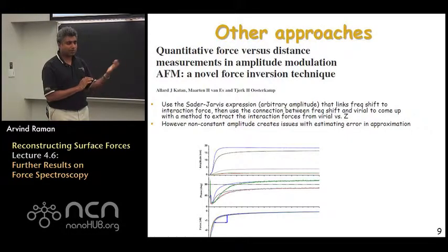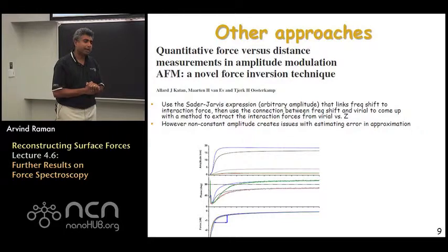So when one is using that formula in the situation of tapping mode AFM, where the amplitude changes as you approach the sample, there is a question that comes up about how uniformly accurate that approximation is. But based on the results that this group has shown, we may not have a mathematically rigorous way of showing that the approximation is a good one, but nonetheless the results do show promise in that we are able to get pretty good reconstruction of interaction forces using this method.